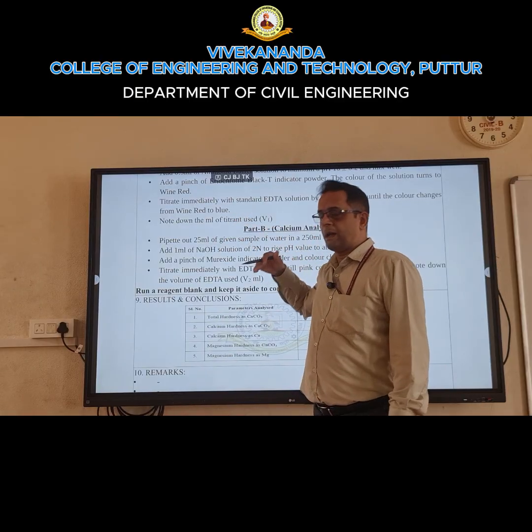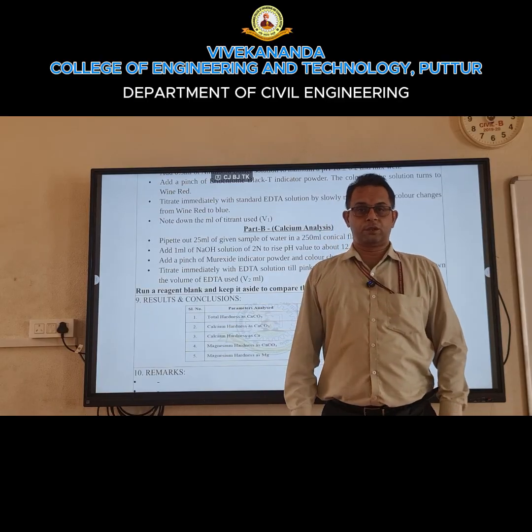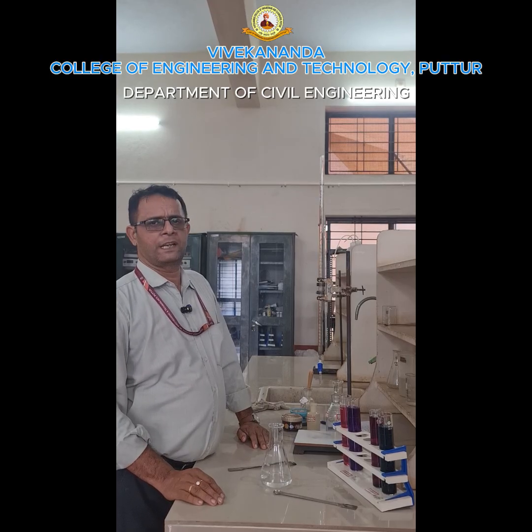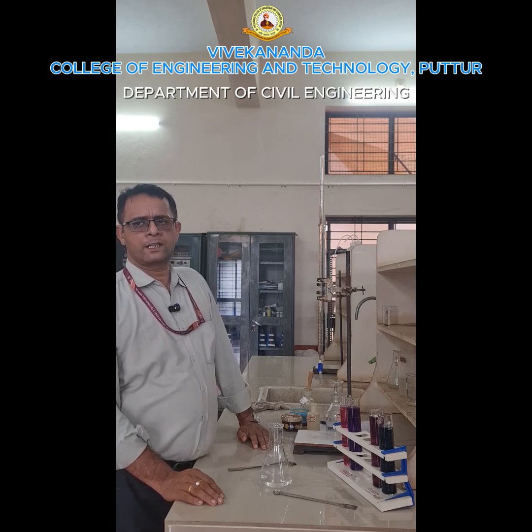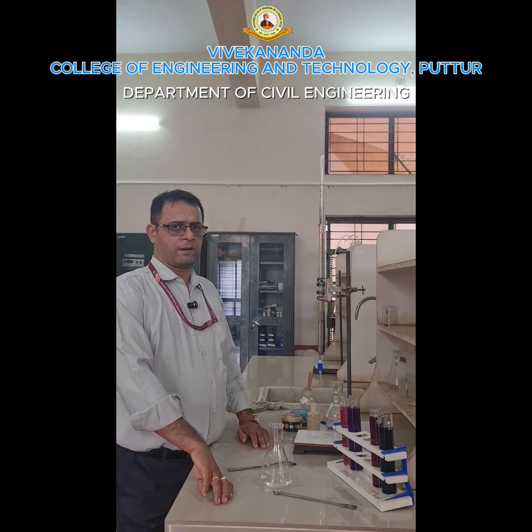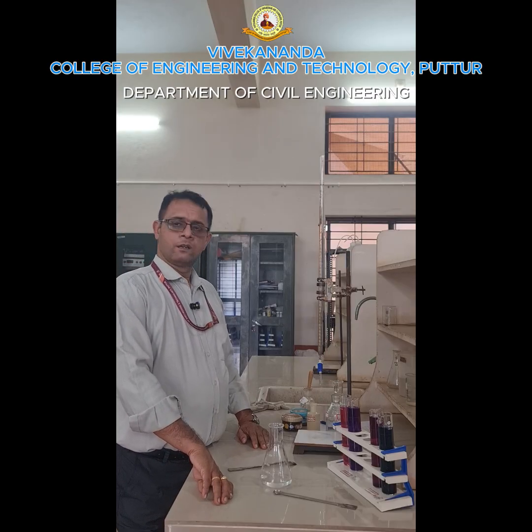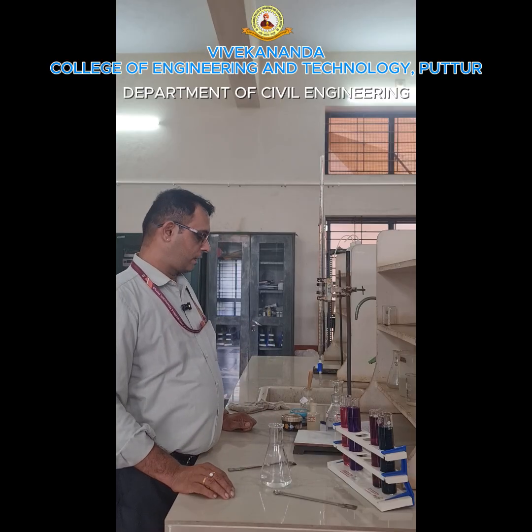So this is the laboratory procedure that we have to do. Next we will see the laboratory procedure. The name of the experiment is to determine the temporary hardness, permanent hardness, total hardness, calcium and magnesium hardness of a water sample. Now we will see what chemicals are required.